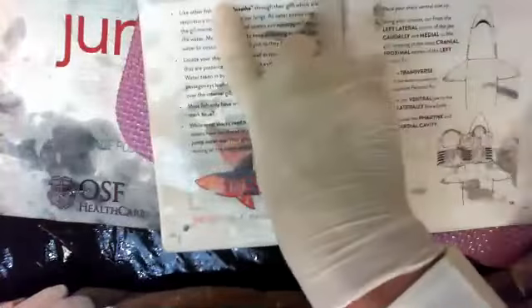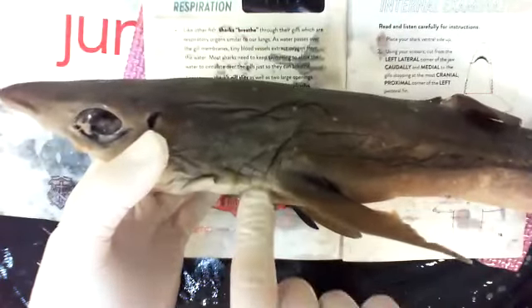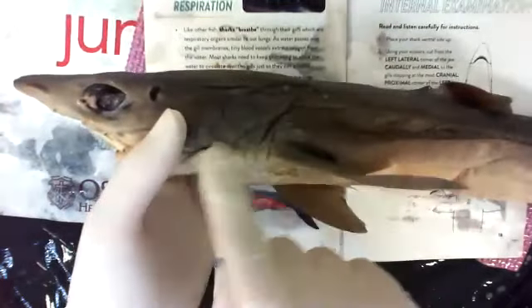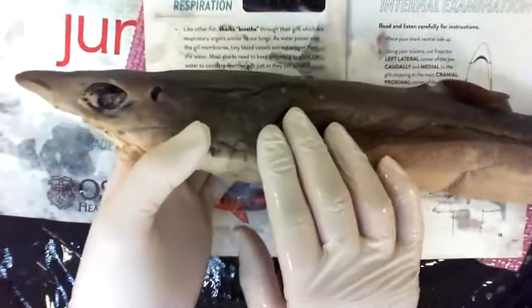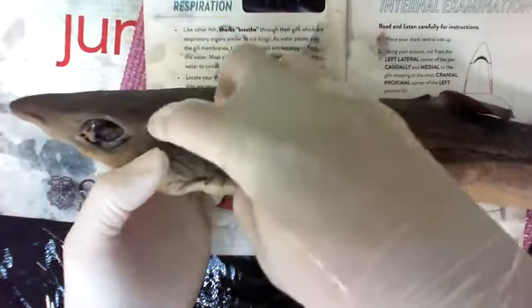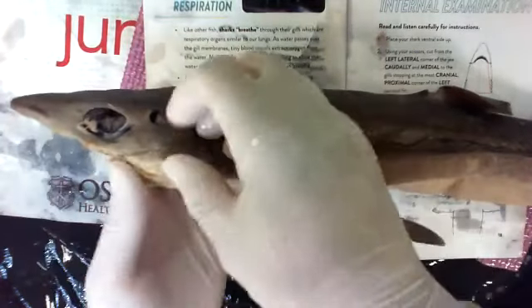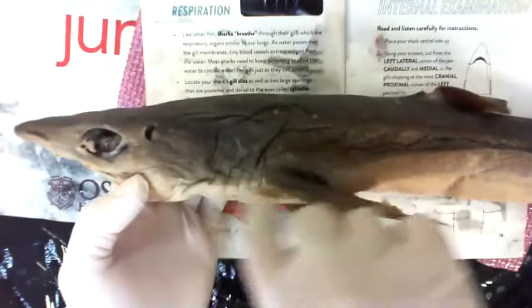Next page. Now we're going to get cutting inside of respiration. So the respiratory system. Gills instead of lungs. When a shark needs to breathe, it has to push water over the gills. It doesn't have a device like a bony fish that can flop and constantly recirculate water. So sharks need to move most of the time. If they have the spiracle, which not all sharks have, they can suck water into their cheek, squeeze the cheek, and blow it out the gill. So they can actually just keep puffing it.